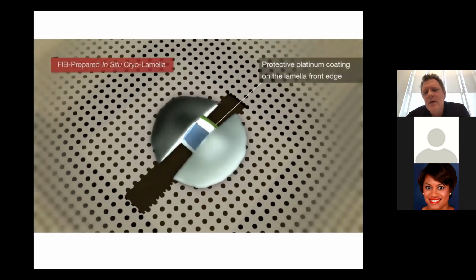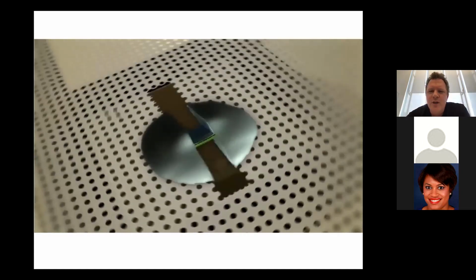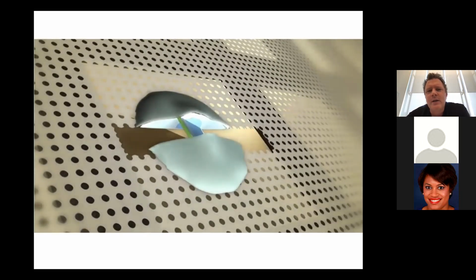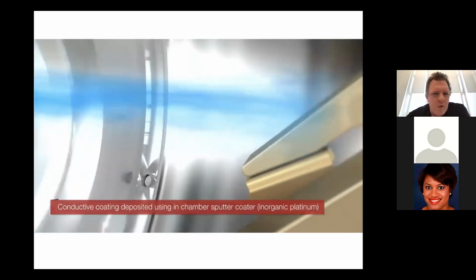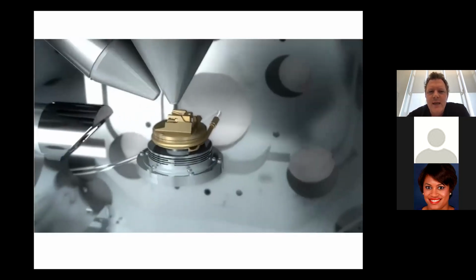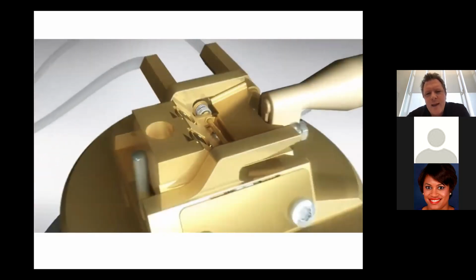And you'll see that the results from this are very compelling, very exciting, because you start to see not just the structure of an individual protein complex that you would get from single particle analysis, you really start to see what's called the molecular sociology of the cell. So who is interacting with whom, who is talking to whom in terms of protein complexes in the cell, as they would have been when you first froze that cell. So this is now your coated lamella.